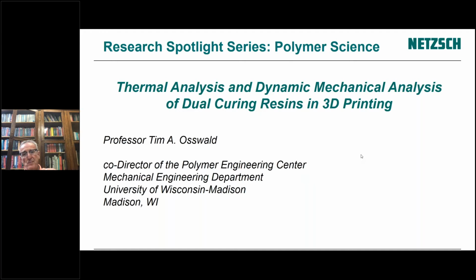I think we just got, let's see, I'll ask this quick. We do have a few more minutes left. So I'm curious, the dual curing mechanism, does the UV curing degree affect the thermal curing efficiency? Can you ask that again? Well, he's curious if the dual curing mechanism, does the UV curing degree affect the thermal curing efficiency? In other words, will the second thermal curing cycle need to be changed?